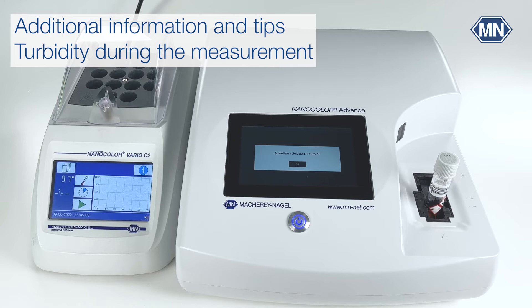If you encounter turbidity during measurement, the NTU check will warn you and the result cannot be trusted. If the turbidity does not settle properly, it is helpful to place the cuvette in the still-hot heating block for one minute, as turbidity will settle much faster in warm solutions.